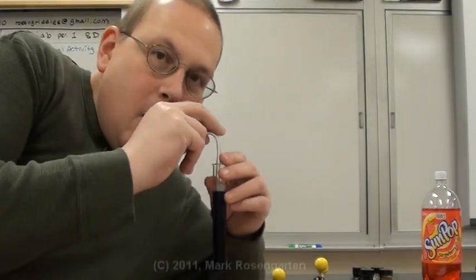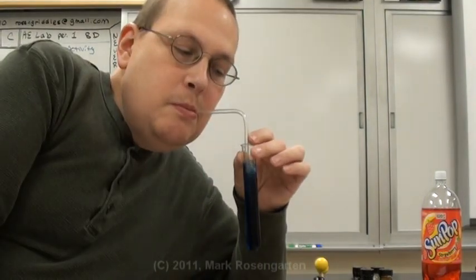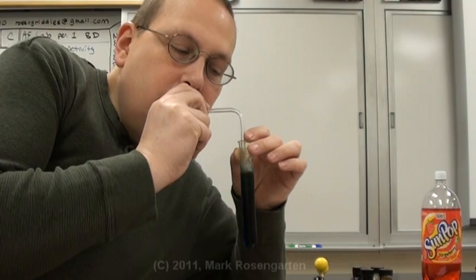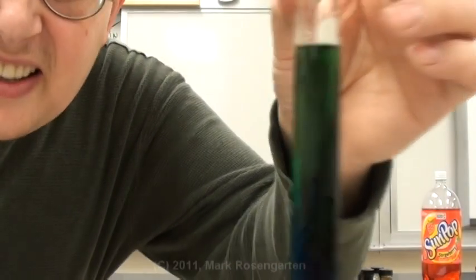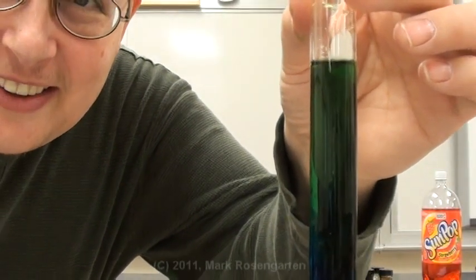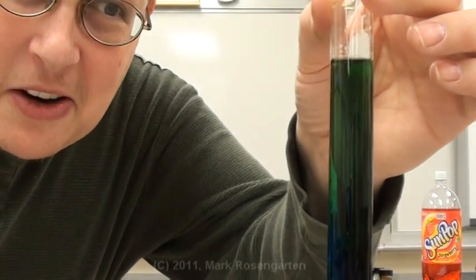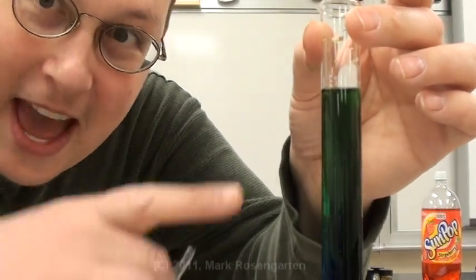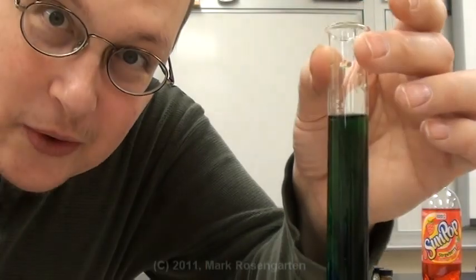Allow me to demonstrate. I'll add some carbon dioxide from my breath. See that green color? That came about because I breathed CO2 into it, and the CO2 acidified my solution. That is what you're going to look for when you're doing this lab.